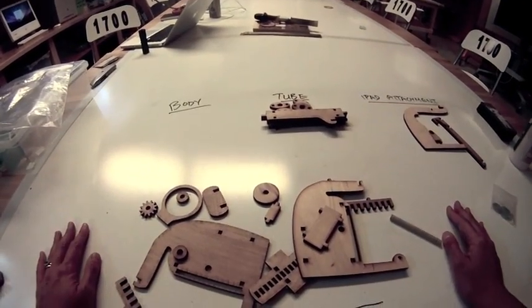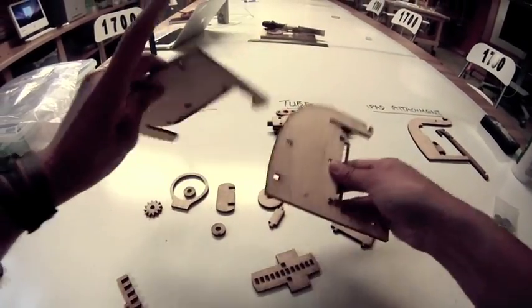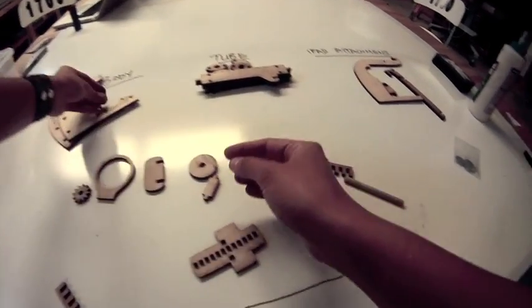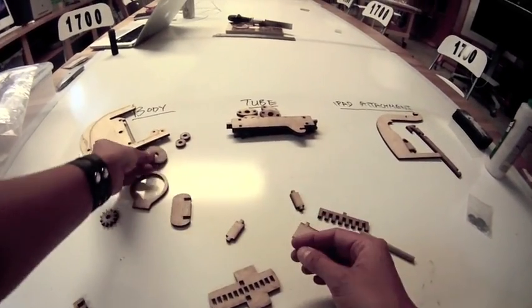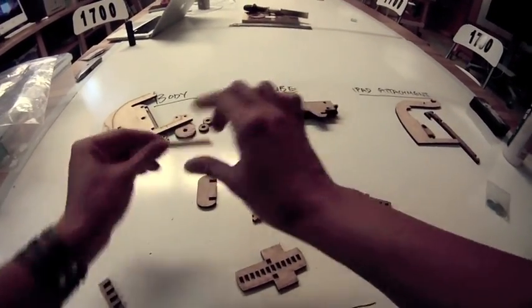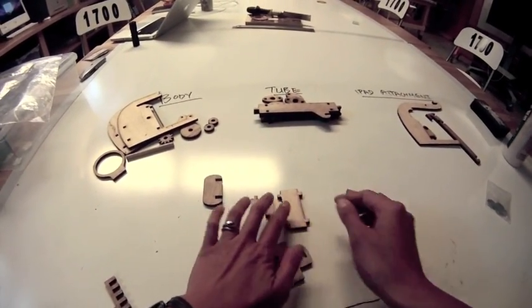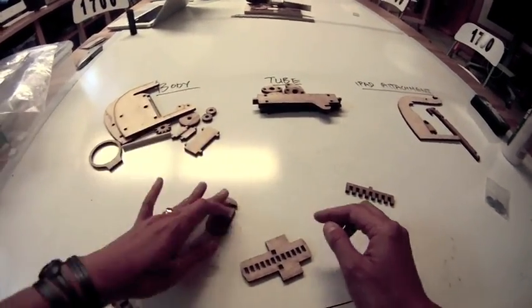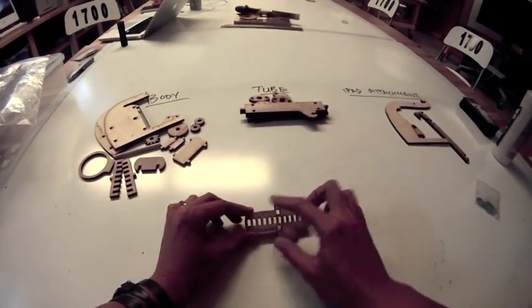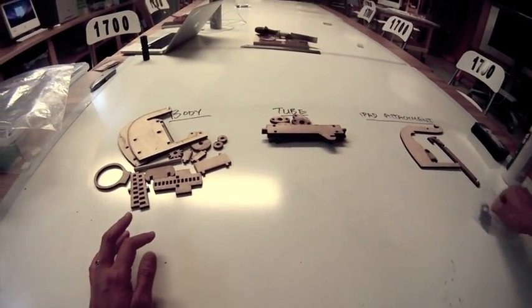Everything else belongs to the body of the microscope. You should have two big body pieces, two small circles, and one larger circle, then a ring, a gear, a dowel, two little small rectangles, a bigger rectangle with notches, two comb-shaped pieces, and this complicated piece with a bunch of holes in the middle.